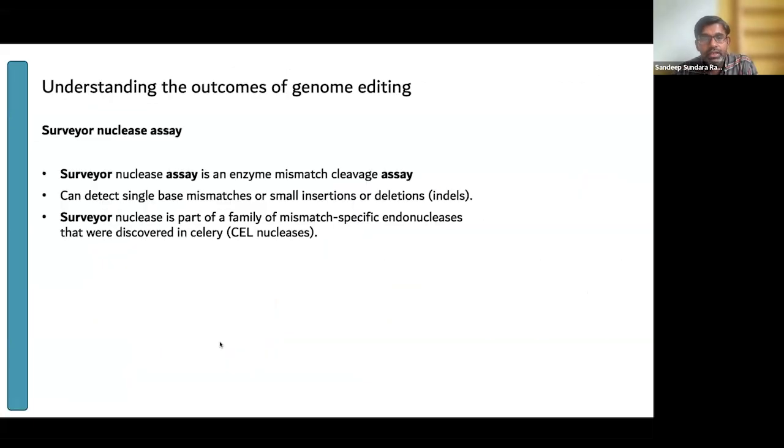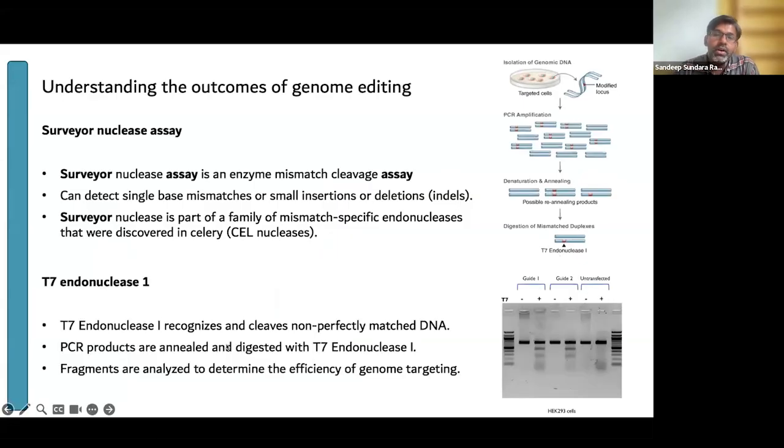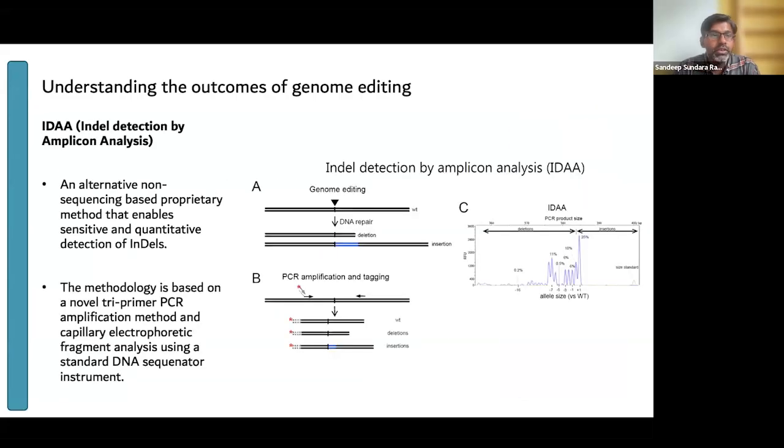And I've done another course just a few days ago, and I'm going to be very frank with this. All guides do have some off targets. All guides will have an activity that you will not know. Again, to be open with this, it's the Cas9 that is actually making the double strand break. So the guide is just guiding the Cas9. Where it is binding is the site where your nuclease is going in and cutting.